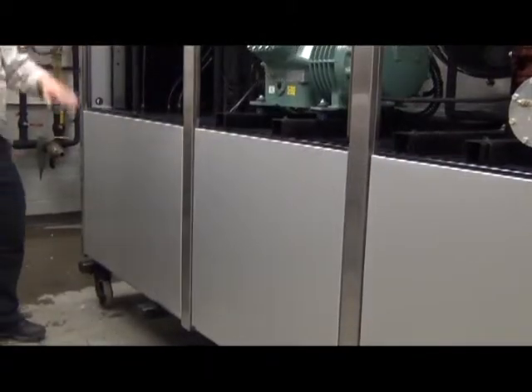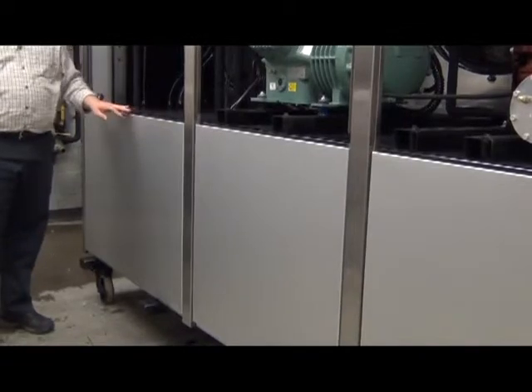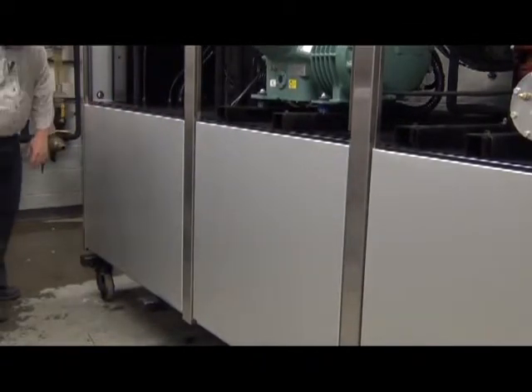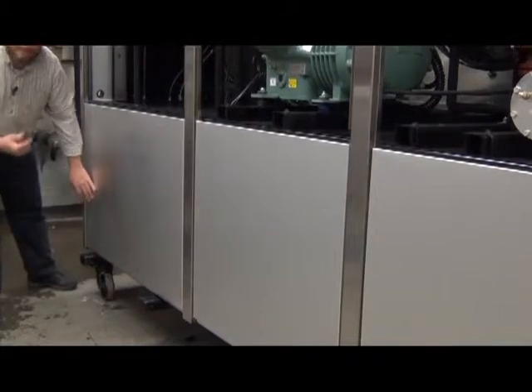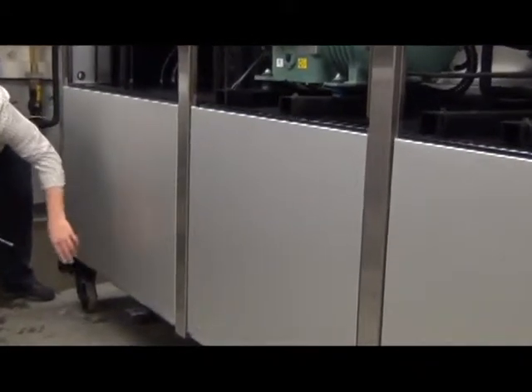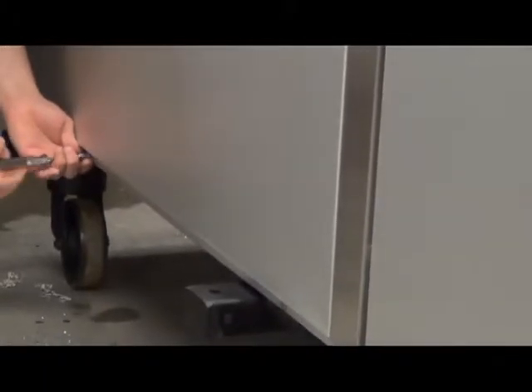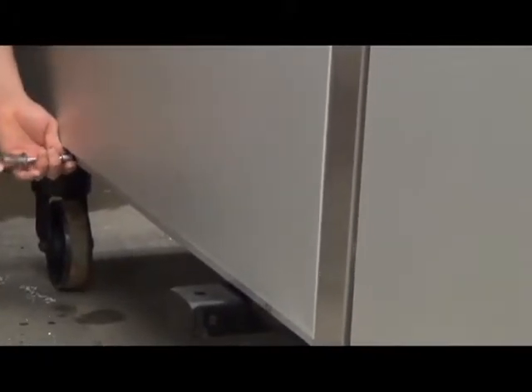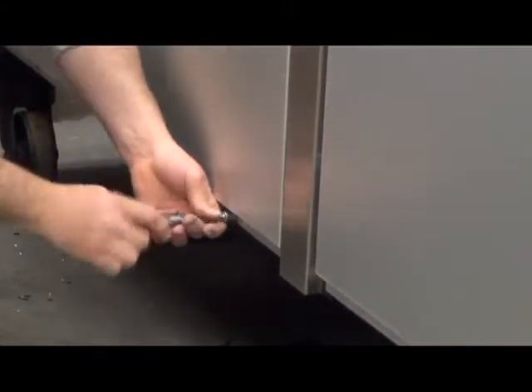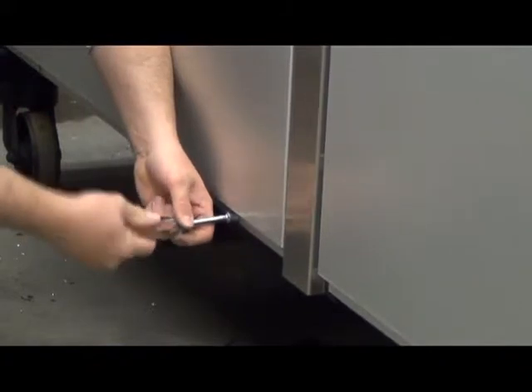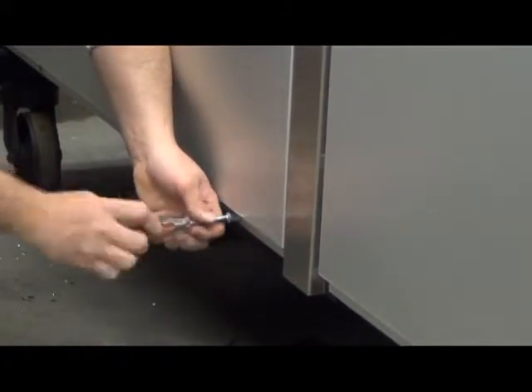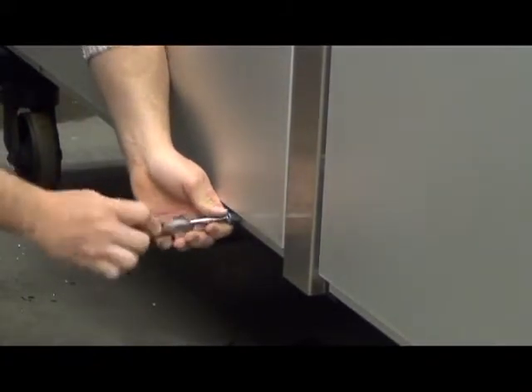Once you have the top panels removed and safely set aside, then you can remove the bottom panels, and you do that by using a 7-16ths nut driver. There are either one or two bolts in each of the bottom panels, and you just unscrew these. Then just take the panel off.